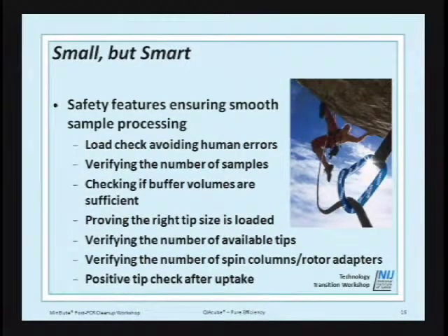So as I mentioned, there's a load check before you start. Verifies the number of samples. The instrument is fairly intuitive, so it will let you know if you have enough buffers within the instrument to process the amount of samples that are in there. It'll let you know to add more buffers if you don't have enough in there. Also checks the amount of tips that are in the instrument, and if you don't have enough tips in there, it'll also prompt you to add more tips.